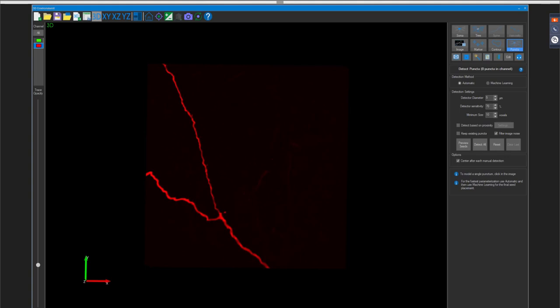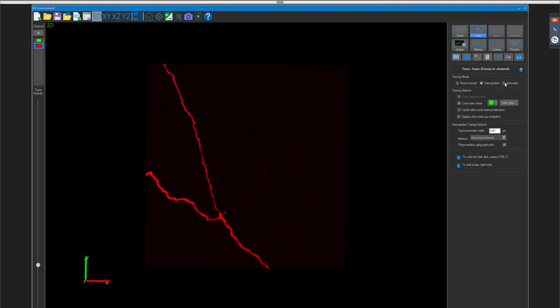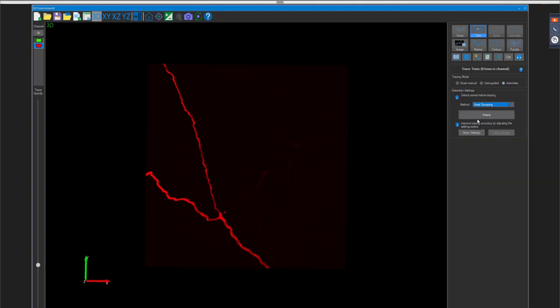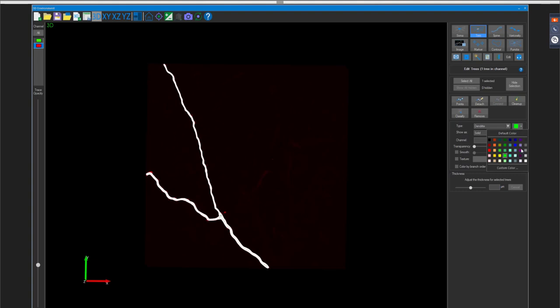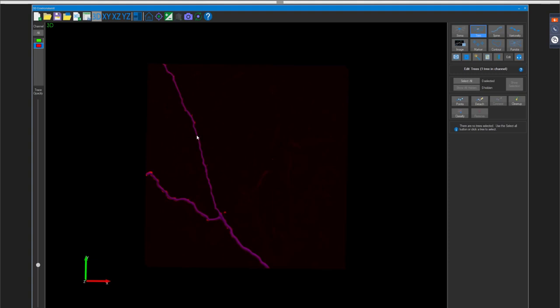Sue highlights how instantly the channel image display updates when switching channels — a result of refactoring the entire image engine. The channel panel allows you in the 3D window to specify what you want to see, but goes further by associating traced structures with specific channels. For example, TJ's automatically traced axon is now associated with the red channel.